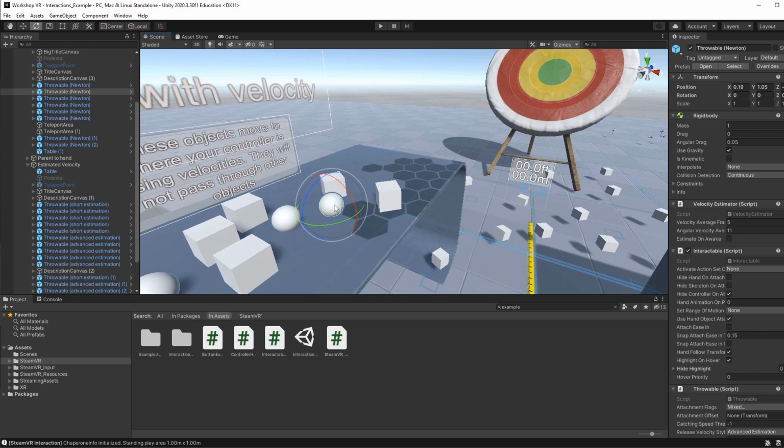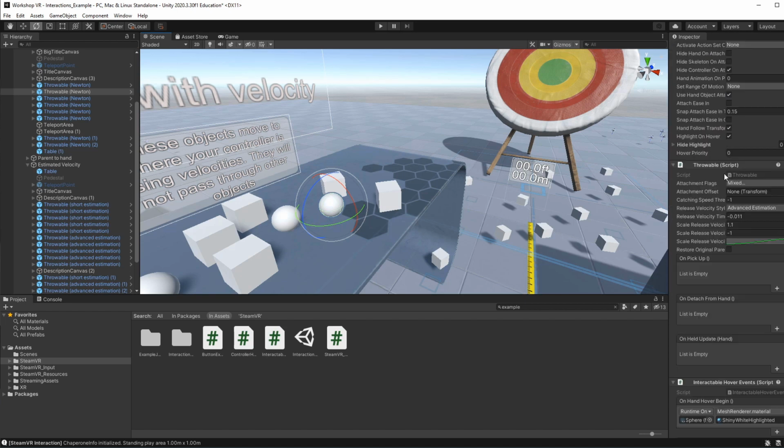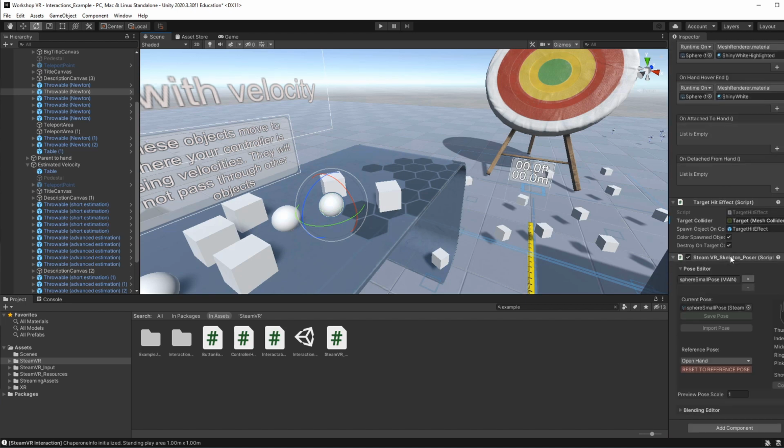That is being able to interact with the virtual world and being able to grab it. I'm going to keep the components of this game object. As you can see, I clicked on this game object that I want my data to have similar behavior, and you can see the different components that it has.